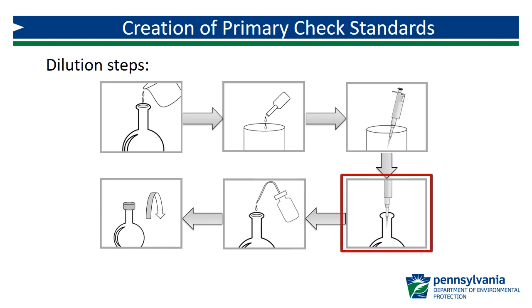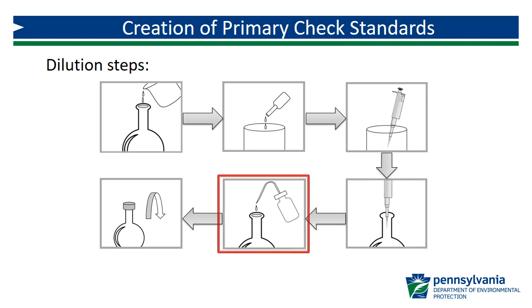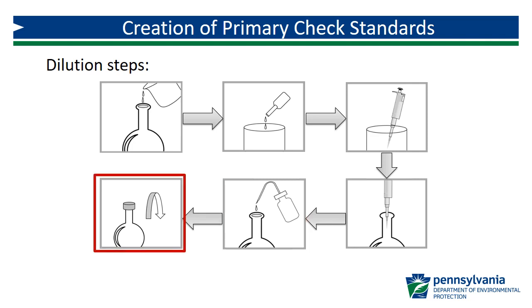Pipette the V1 volume from the pipette tip into the volumetric flask. Check instructions for use, but for many adjustable pipettes, the second stop is for expelling solution from the tip. Add the reagent grade dilution water to the volumetric flask, allowing a small amount of room in the neck, then use a wash bottle of reagent grade water or a dropper to fill it to the graduation mark. Cap the flask and invert gently to mix the solution.